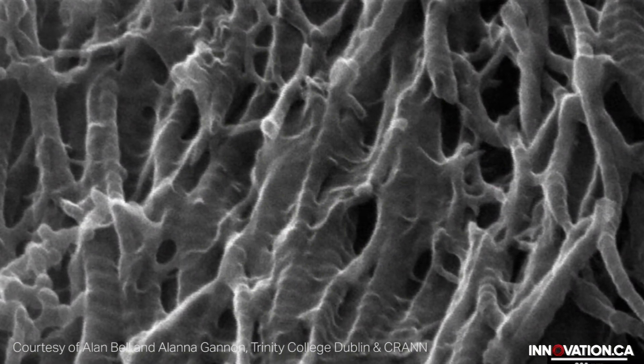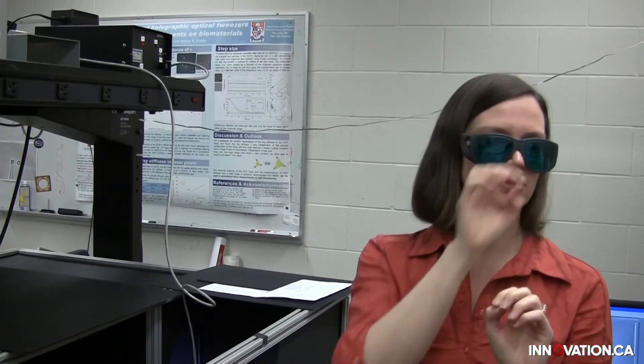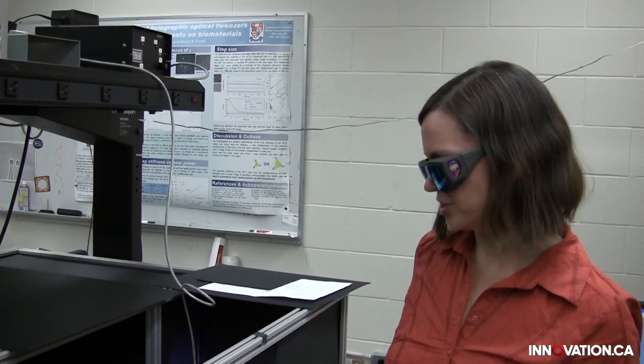And she is looking to see what are the differences at this point in the solution versus that one versus that one. Are things happening all at the same time or are they happening differently? How quickly do these collagen fibrils start to develop elasticity and their mechanical properties? And those sorts of questions are really being enabled by this instrument.